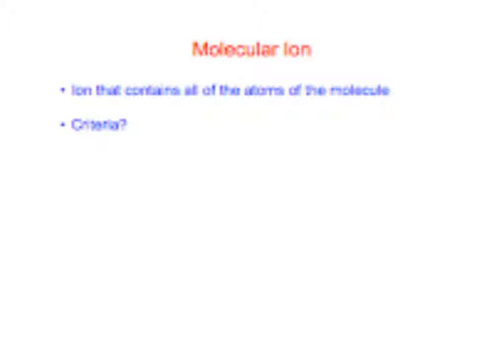All right, so the first thing we're going to look at here is the molecular ion. That's the most important ion that we can observe, really. And so we need to be able to identify whether an ion that we observe is the molecular ion or not. There are situations where if molecules readily fragment, they'll fragment so much that there won't be a molecular ion observed. All right, and we need to be able to know that.